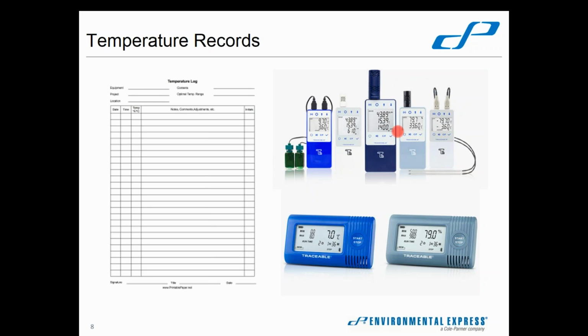Alerts and alarms about when things approach warning limits or have exceeded warning limits. And then it's a continuous thing that can always tell you if your samples are in control or if your storage is in control. And that's a really cool function.